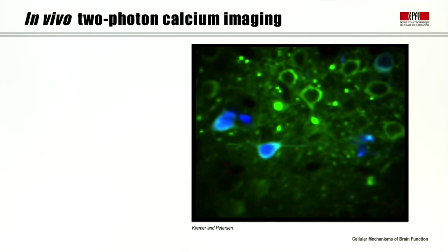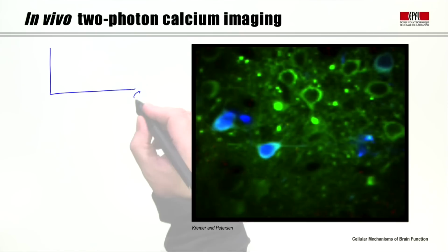Imaging the structure of the nervous system is, of course, extremely interesting, but even more interesting is to image the neuronal activity of these cells and synapses at high temporal resolution. And one way in which this can be done is by using calcium imaging. Calcium turns out to be a relatively good thing to study. It's relatively easy to make calcium binding molecules that change their fluorescence, and Roger Tsien initially developed small molecule calcium fluorescent sensors that would change their fluorescence depending on calcium concentration.